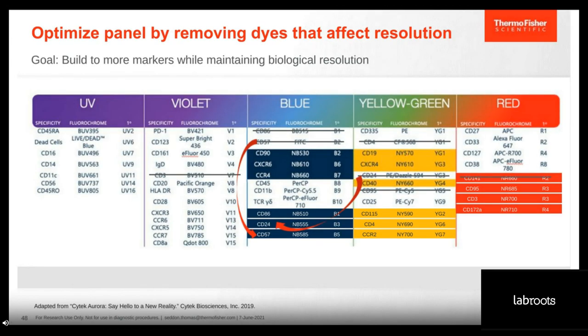And so you can see that here. So now you've moved CD24 over there. In this case, what I've done is taken CD44 from where it was on NovaFluor Blue 585, CD141 away from the NovaFluor Red 660, and then taken CD80, which was previously at NovaFluor Blue 555, and taken those from the panel. And you still end up with a 43 color panel.